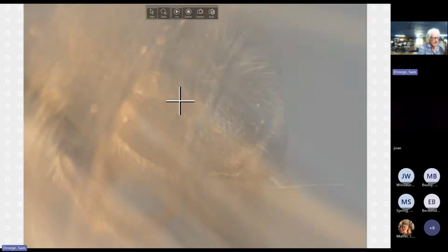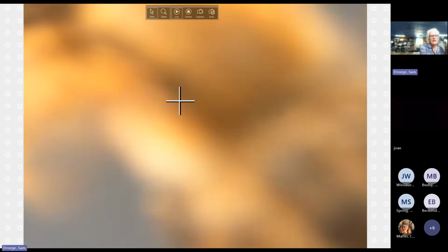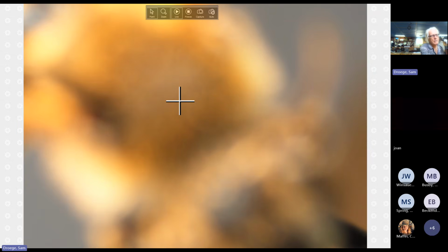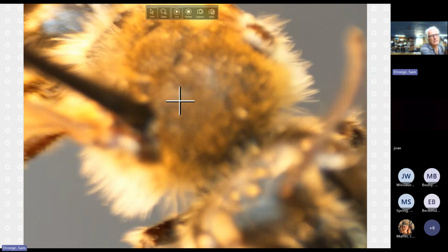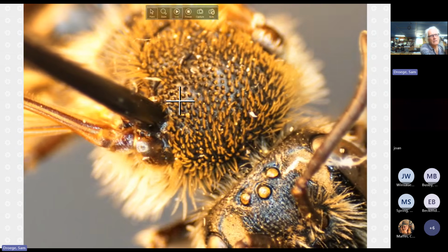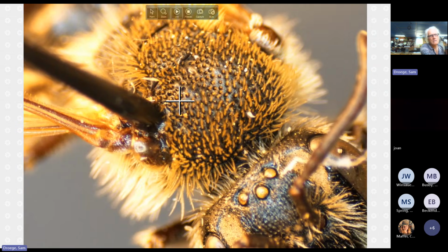Next, we will travel to the scutum. And what we should see is very rough surface, a lot of topography, lots of hills and valleys. And also the pits so closely spaced that they essentially are overlapping one another. And that does not look like the case.